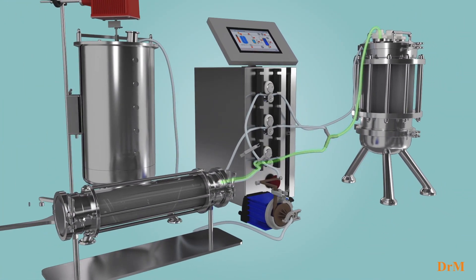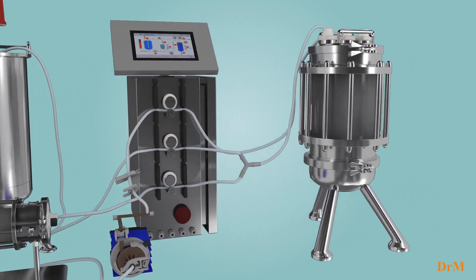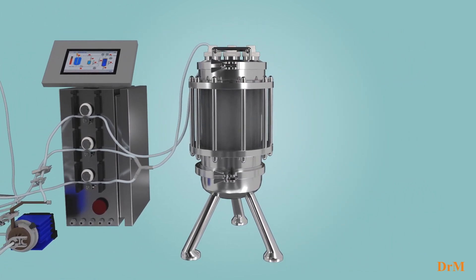To maximize productivity and bag use, our filters come with a back-flush functionality. To extend the lifetime of each bag filter even further, we have the Contaback SU filter.